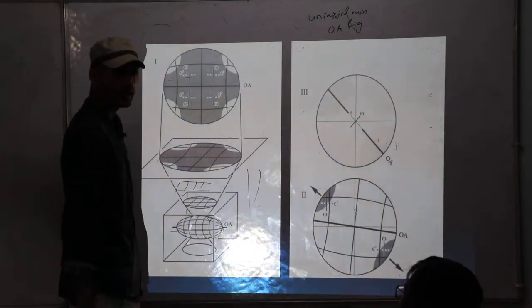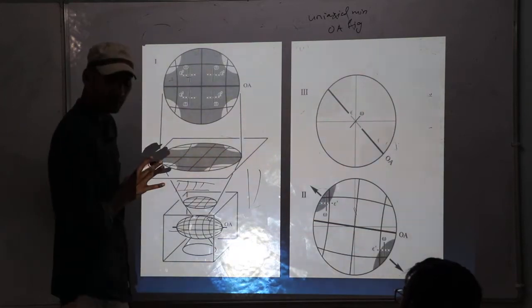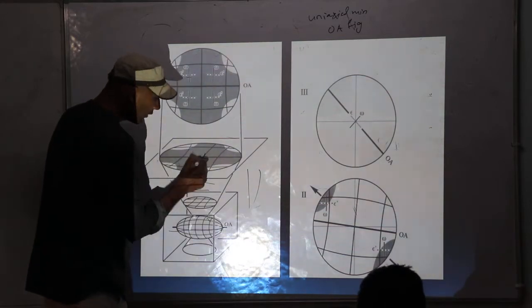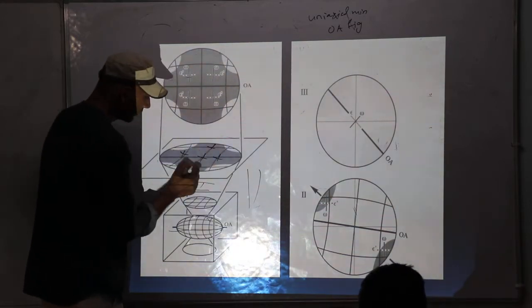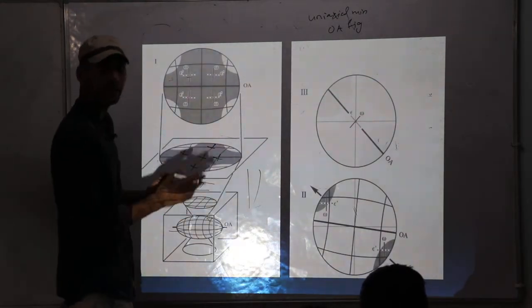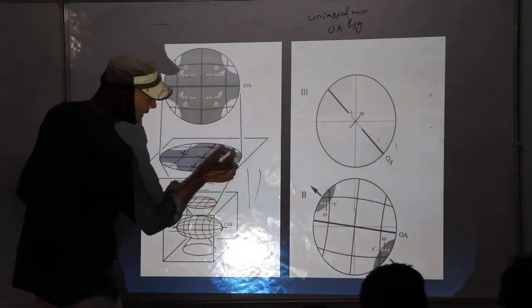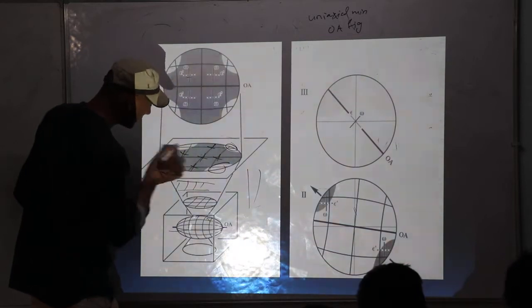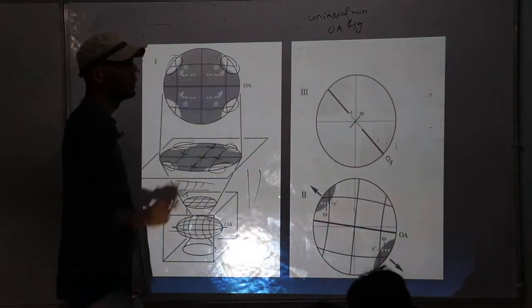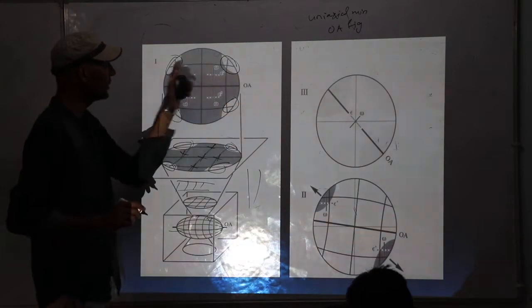If there is an increase in radius, there is a decrease in curvature. That means the lines are more straight. Got that? So what happens? Everywhere you can see there is matching of vibration, because the angle changes by a very small amount at a very great distance. Only these positions are showing interference, very few positions where the vibration is mismatching with the vibration of upper polarizer and lower polarizer. That position is very less.